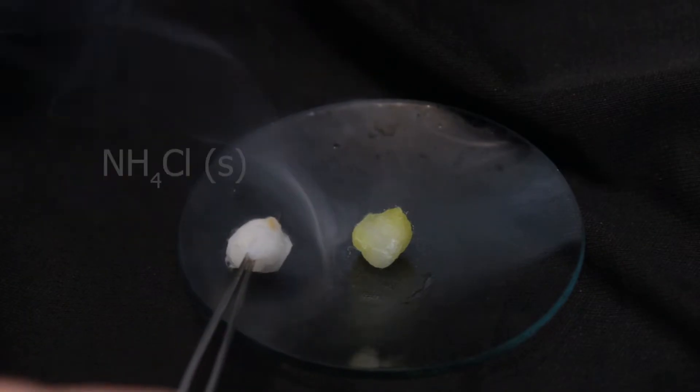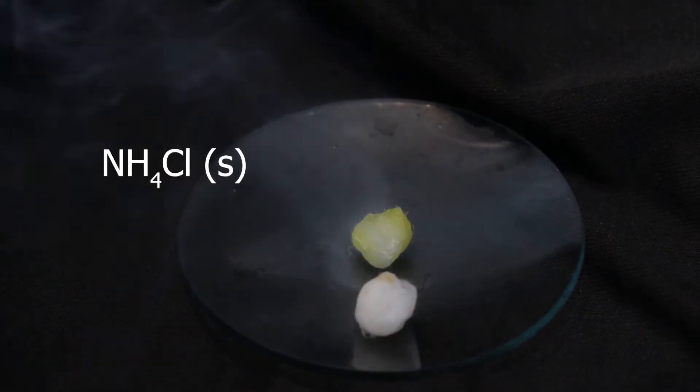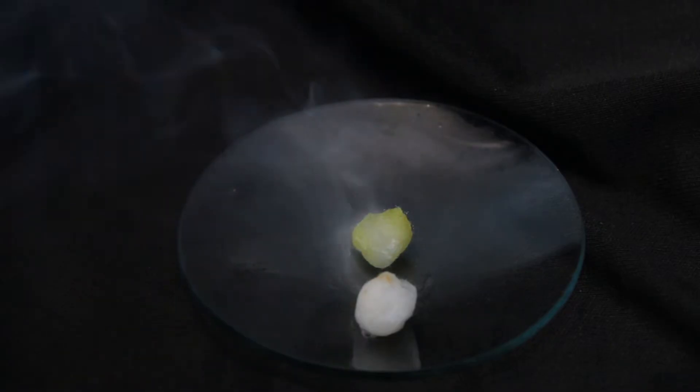What is this white smoke? White smoke is ammonium chloride, a salt, a solid. These tiny crystals which formed in the air look like smoke.